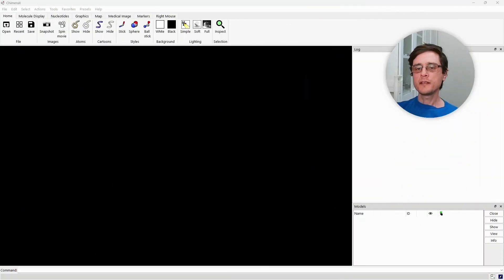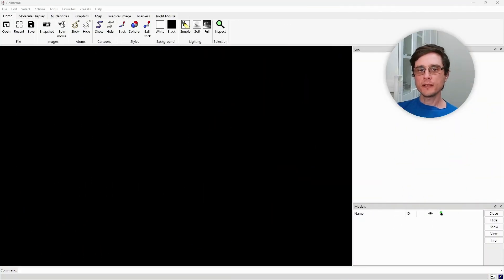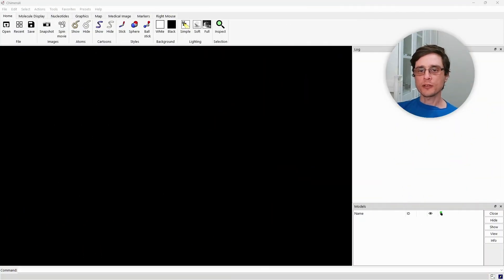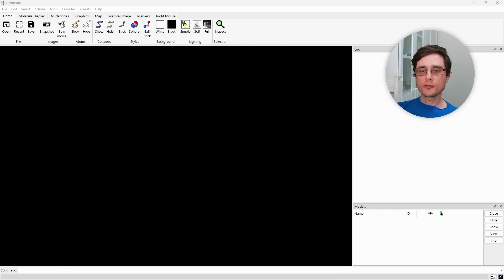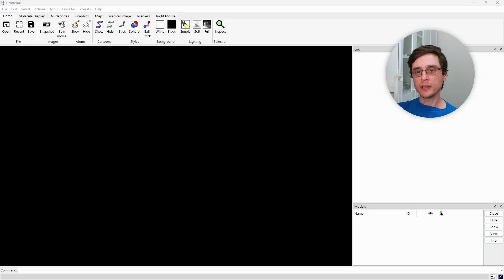Once ChimeraX is installed, we can get to work. This is the ChimeraX interface. We can build new structures from scratch, which we will not do this time, and we can load existing structures from files on our computer or from online databases.